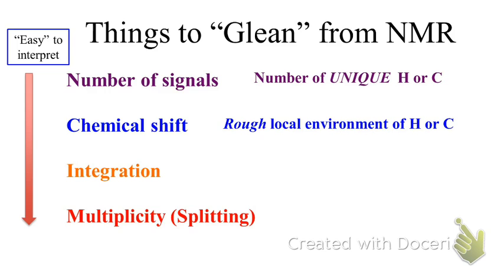I'm pretty sure every lecturer allows or provides a cheat sheet of IR and NMR data. Use that information. So use your chemical shift much like you would do IR. Does it roughly look like it falls within this range? Yes. That probably means that that atom, hydrogen or carbon, is attached to whatever it's referring to. Because there's a lot of data out there, depending on the chemical shift tables that you look at, students have a tendency to overanalyze it and start putting in all sorts of crazy different structures.